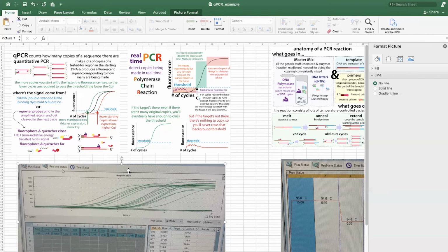And so when you do a PCR, if you were to measure the copies as they get made, you're going to see some sort of S shape like this, where you start below the level of detection, just below the level of noise. But then you start seeing a huge increase in your copy number, and then you start running out of the ingredients that you need to make copies. So you get this S-shaped curve. And there's this point where you cross the threshold and you start to be able to really see these copies get made, if you can measure them, remember.